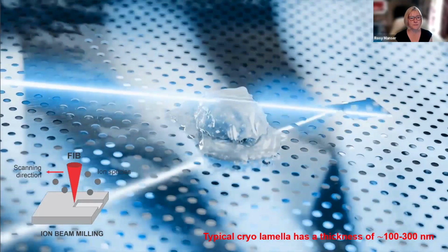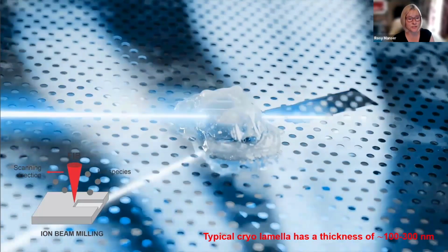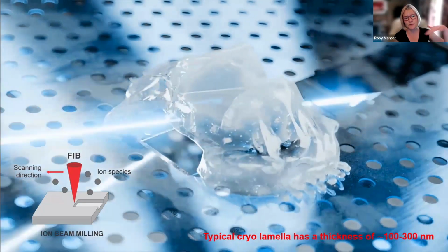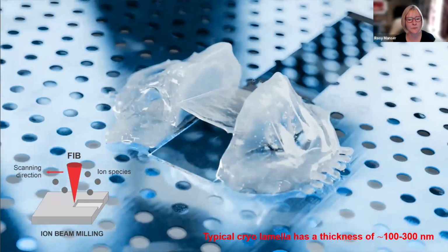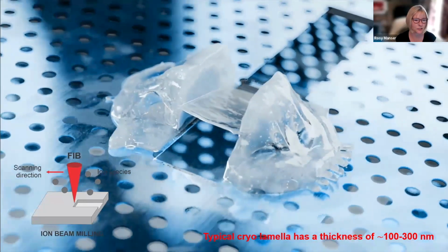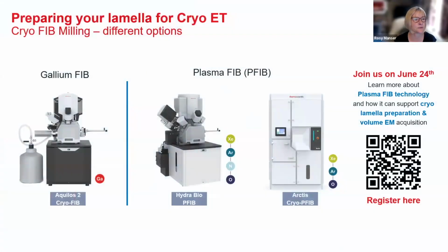So from the cryo-fib perspective, this is exactly how it works. So you fib mill your specimen from either orientation to be able to generate this lamella, which is somewhere between 100 and 300 nanometers. To be able to generate that lamella, you can do it with a couple of different systems. So we have a gallium fib system, and we have 2 alternative plasma fib systems, which are routinely used for being able to generate cryo-lamella.